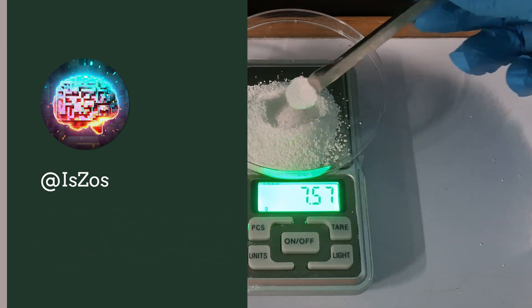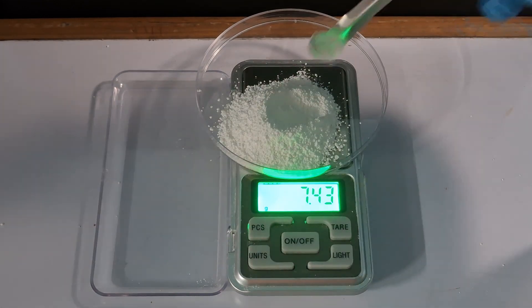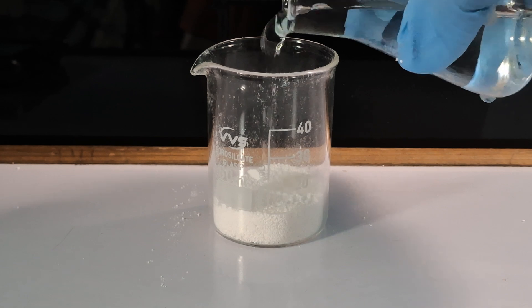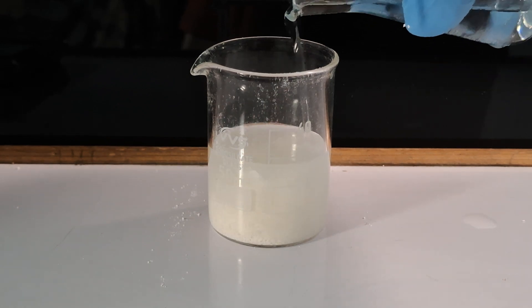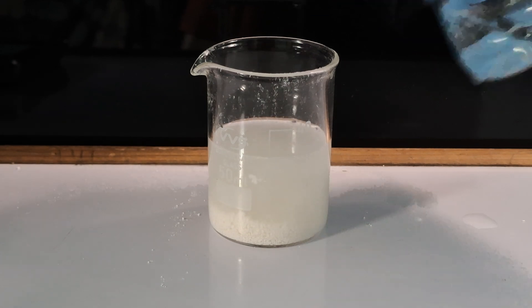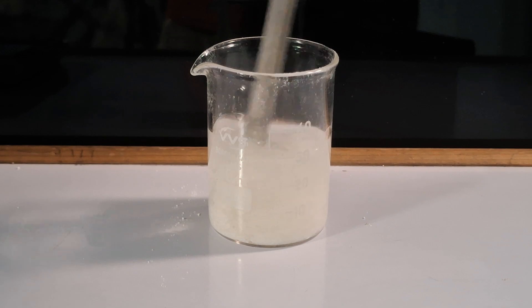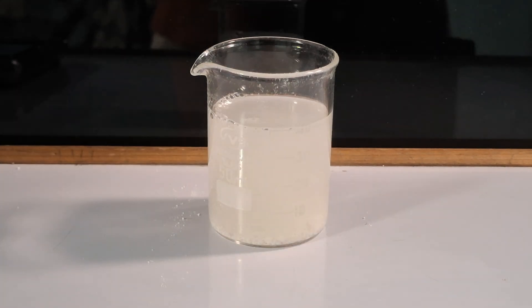Starting off, I weigh about 7.5 grams of sodium benzoate. Next I dissolve it in an adequate amount of water. I continue adding water and stirring the solution until all the sodium benzoate has completely dissolved.